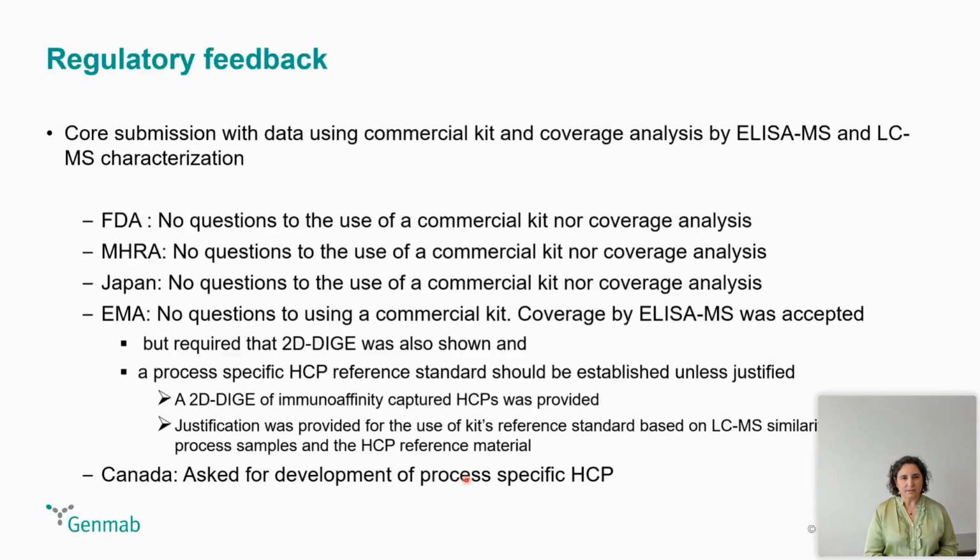Having shown this in our core file, the feedback from FDA was that they didn't have any questions at all on the use of a commercial kit, nor the coverage analysis. They found we had sufficiently justified why the commercial kit was good enough, and the coverage analysis performed by ELISA-MS was also good enough. The same did the UK authorities, MHRA, and Japan. They didn't have any questions at all.